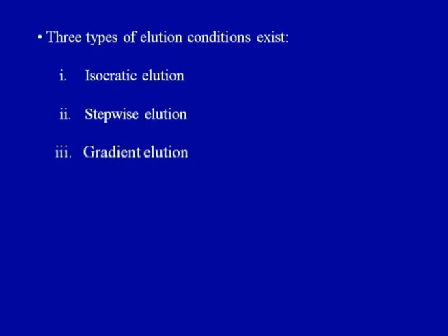You can use gradient elution also rather than stepwise elution. So, it is a continuous gradient here rather than step gradient. So, the composition of eluent, that is pH or ionic concentration, is changed continuously, and sample content should be 5 to 10% of the bed capacity ideally, and column length is usually 20 to 40 centimeter with a diameter to length ratio of not more than 1:5.